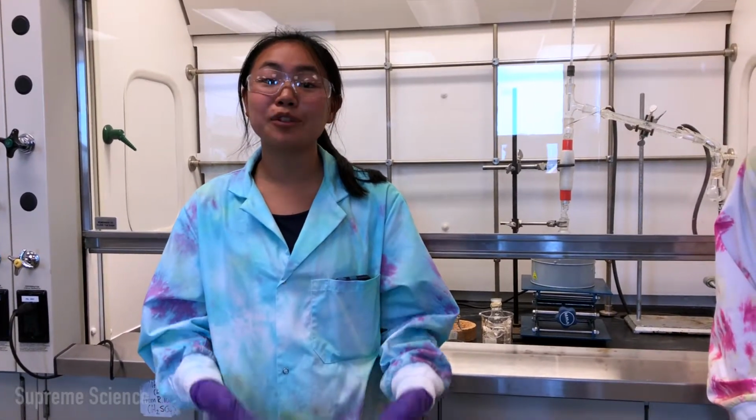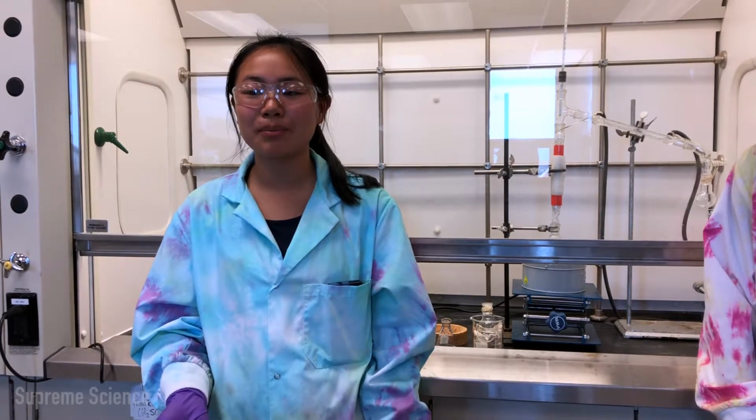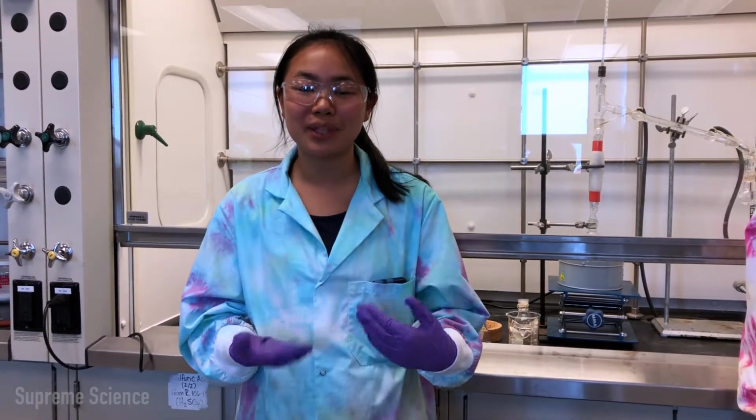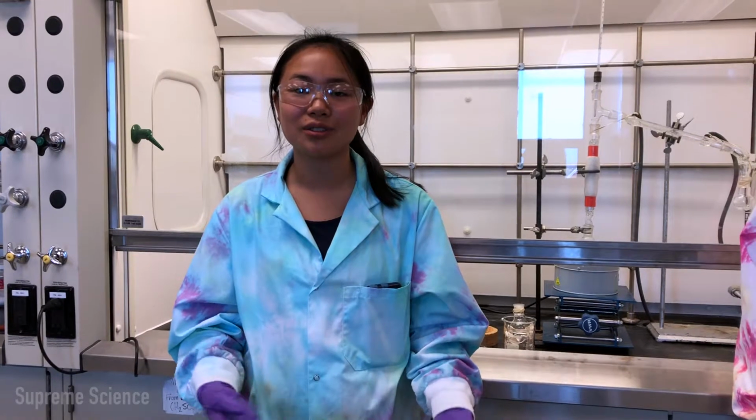Another important thing to note is that the faster you do your distillation, the higher the throughput in the system, but the separation of your components is not as good. This is because there might not be enough time for each of the beads to establish an equilibrium to get that good separation. So it's very important that you find a good balance between distillation speed and separation of your components.